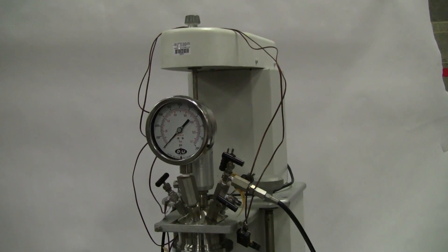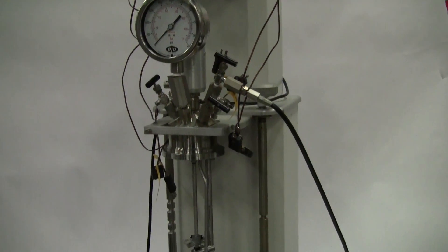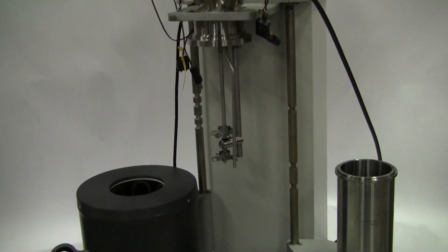Hi, this is Michael Naitow from HitecTrader. Today we're looking at a PAR reactor system. This particular unit is a 2-liter stainless steel reactor.